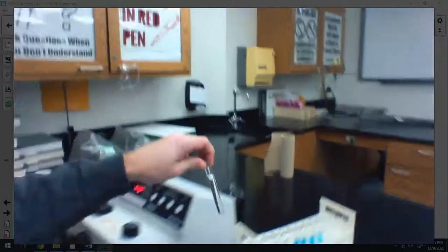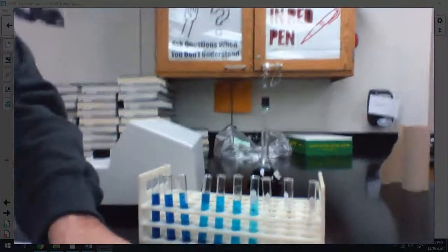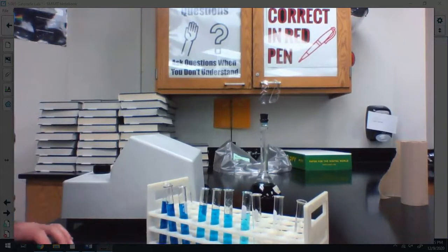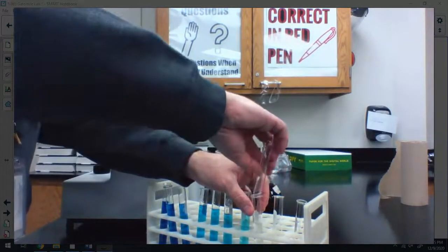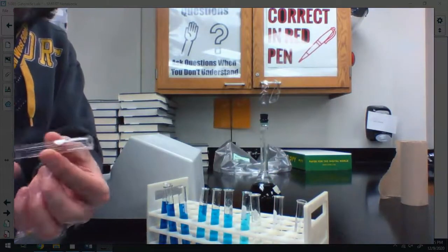All I need to do for the others is fill up my cuvette with that color dye and take some readings. Okay? So I'm going to start doing that. I'll show you a couple here. Let me dump my water back where it belongs. And now my cuvette has some residual water in there, right? That's not great. I don't want that residual water in there.